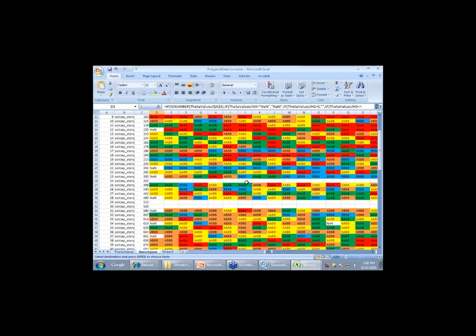There'll be different levels of flexibility with your genotyping data. You can say, this is your genotyping data, we've called it based on how the SolCAP clusters did it. It's something you would ask your lab to do if you don't have Genome Studio, and it's fairly quick and easy. You saw how fast that happened. You would have to work with your service provider, and we would certainly provide the files to do so. Is there a question from maybe in cyberspace?